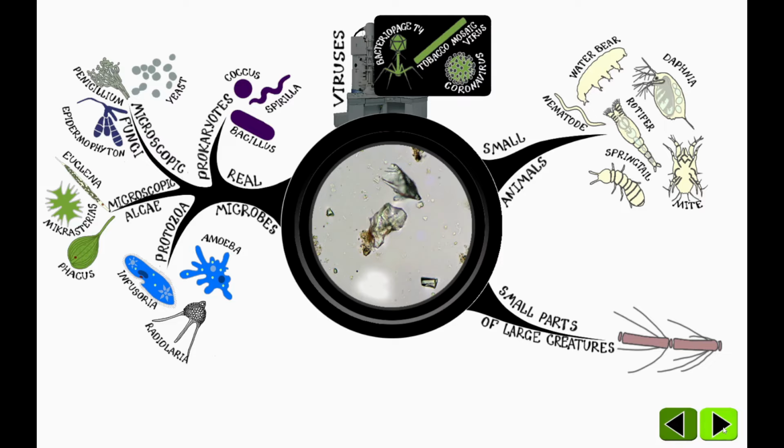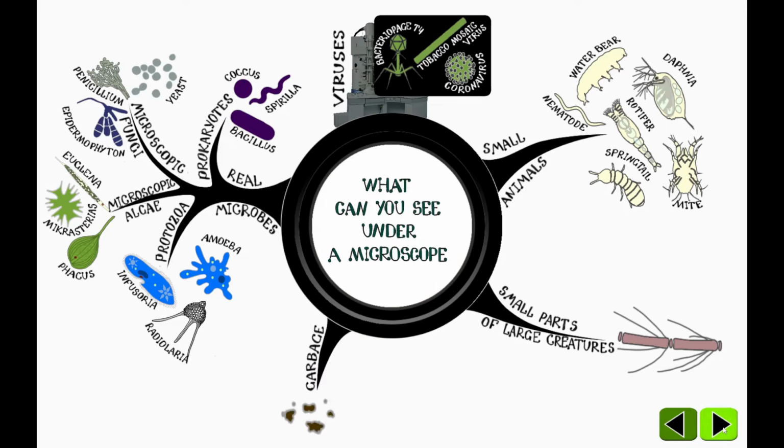I sometimes review the scientific works of students that they send to the Olympiad. Once, I found a picture like this. The student carefully counted the number of bacteria in this photo and even did a statistical analysis. Guys, these are not microorganisms. This is debris. The easiest way to distinguish debris from living beings is by its shapelessness. However, sometimes you can find quite neat and cute debris, just as there are quite shapeless microorganisms.